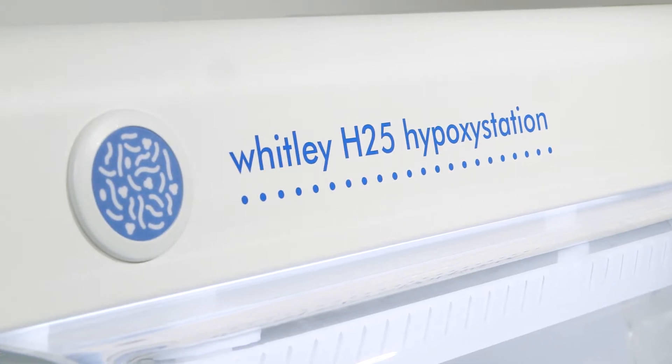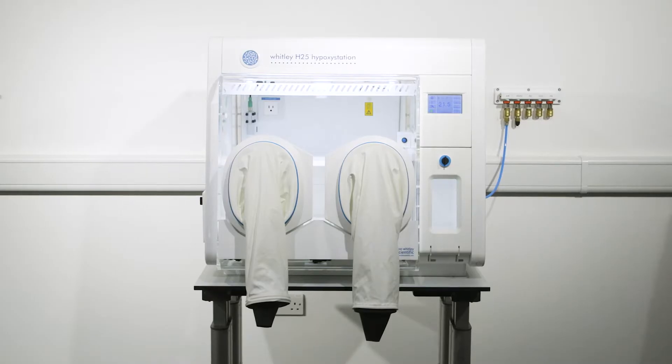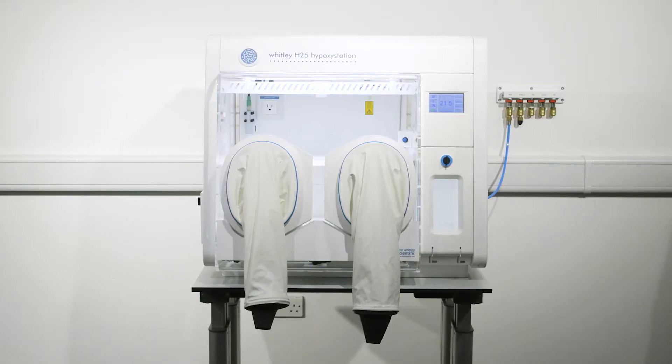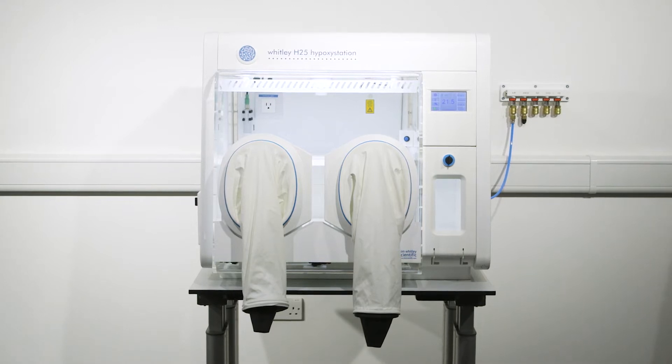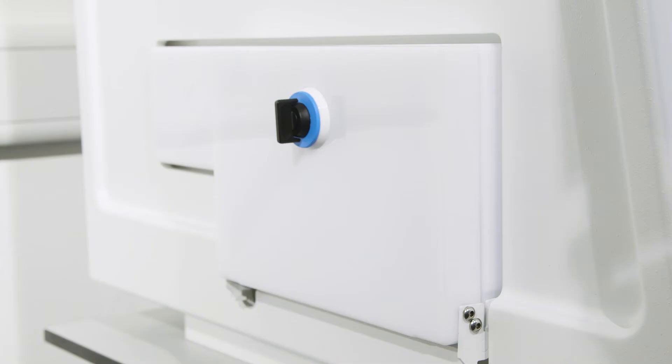For cell and tissue culture researchers who want a small chamber with stable conditions in which to accurately control oxygen, carbon dioxide, temperature and humidity, this workstation is ideal.